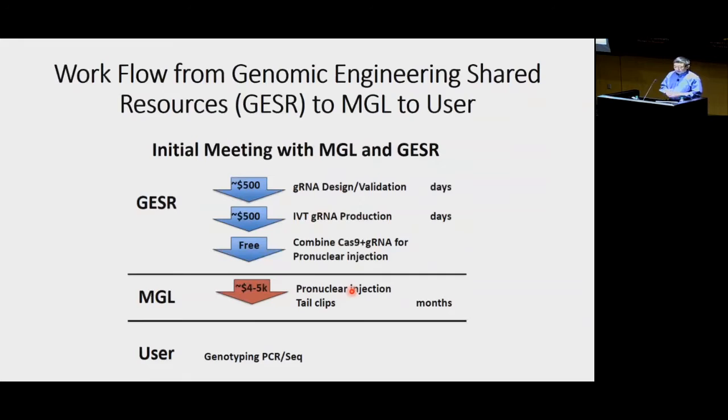From my point of view, I will look at my schedule to see when I can start your project. That's actually very dynamic because my situation changes. Some projects I usually plan way ahead, because I need to order mice, and that takes time. Once I fix a date, I usually follow that schedule. And I know when one of the project reagents is almost ready, and then I can schedule it. So usually it's first come, first served.